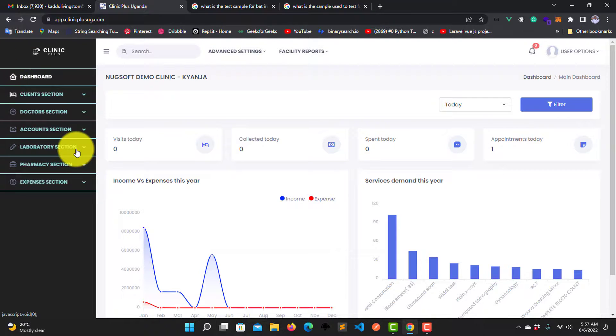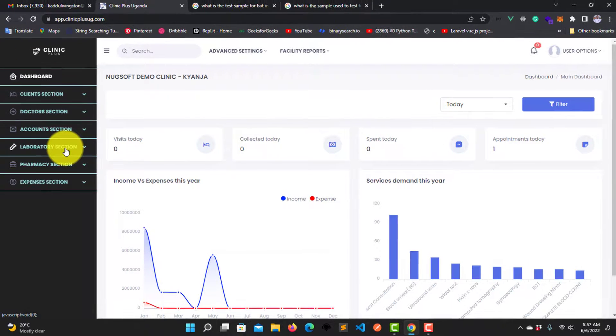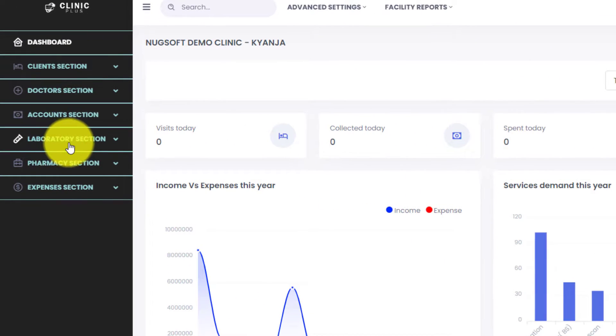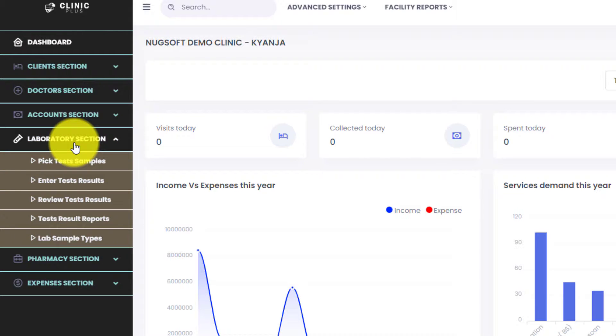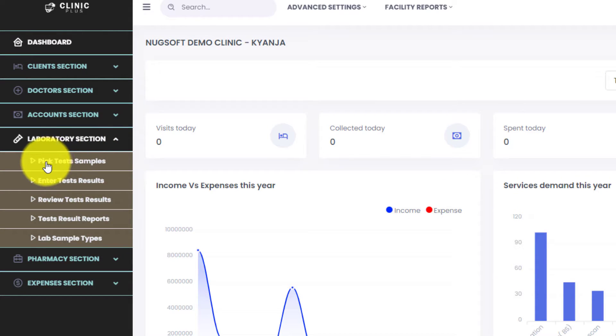We are going to come to this sidebar and click on this link called Laboratory Section. Click on it, and after it expands we are going to click the first link which is Pick Test Samples.